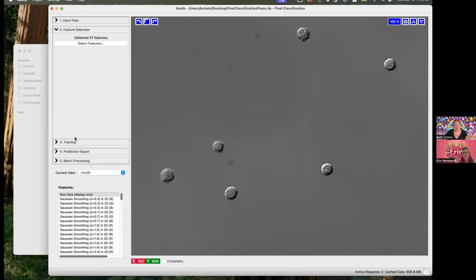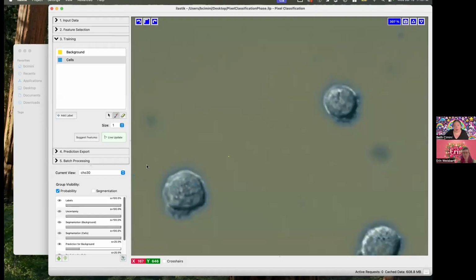If it says the texture here is really different than the texture in the background, which by my eye I'm pretty sure is true, then it will use something like the texture to classify whether this pixel and this pixel versus this pixel have different properties, and learn to split those things apart.